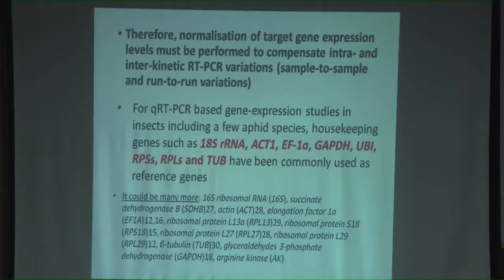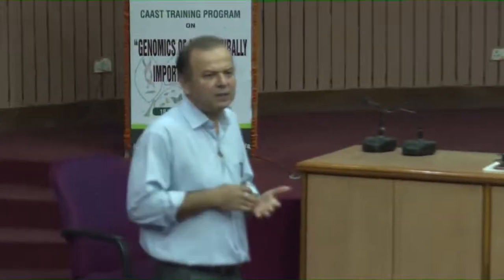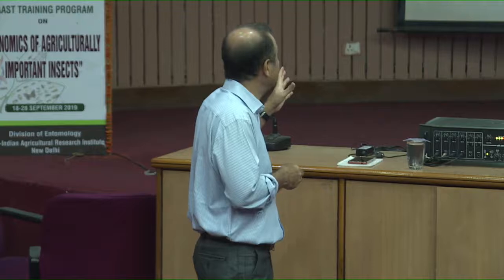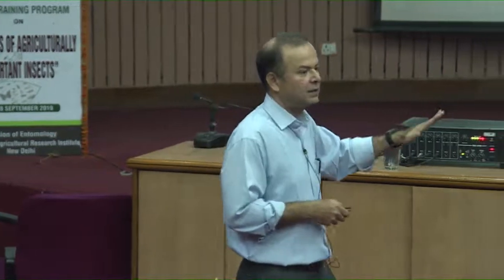What do you mean by assessing suitability? You have to ensure that whatever you are studying, this gene has no effect. Suppose you are studying the effect of starvation on an insect, and you see in the literature that for your insect species no paper says that it is suitable. So, if you have a plan to use say GAPDH or say elongation factor 1A, your responsibility lies in seeing that the expression of elongation factor 1A is not affected by the starvation treatment. Understand?